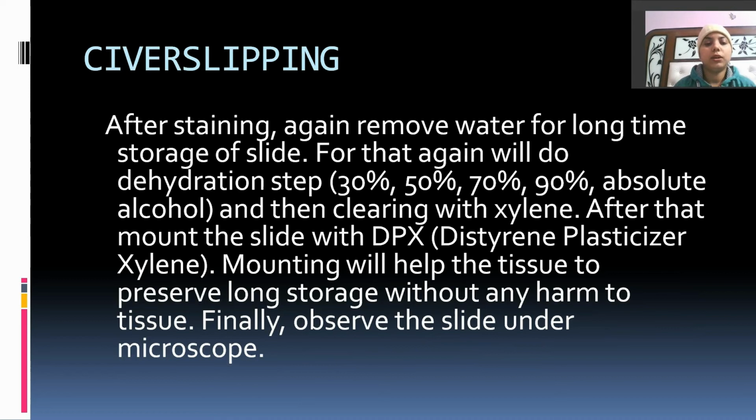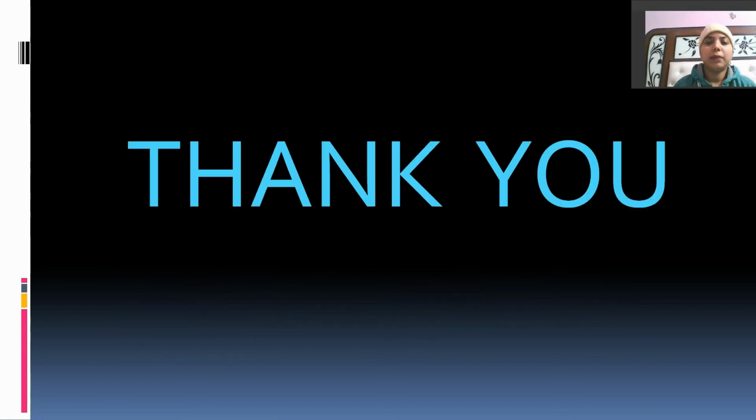After that, mount the slide with DPX, the full form of DPX is distyrene plasticizer xylene. Mounting will help the tissue to be preserved for long storage without any harm to the tissue. Finally, observe the slide under the microscope.